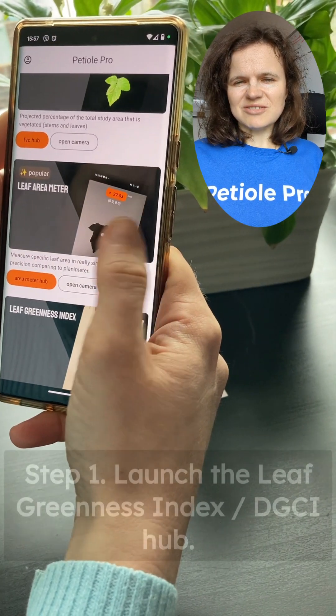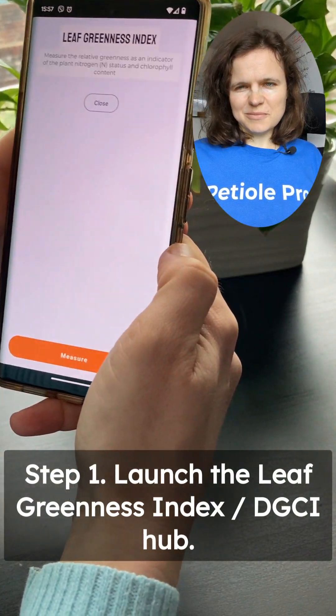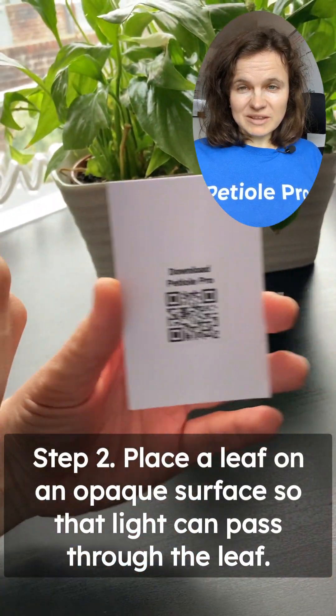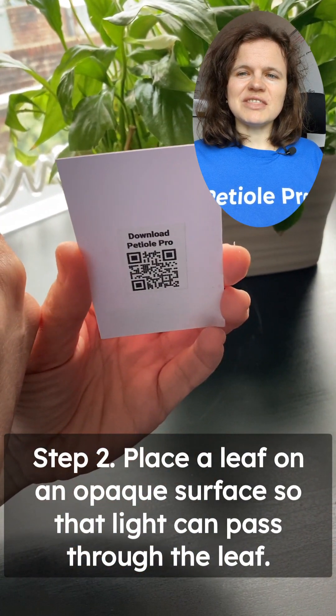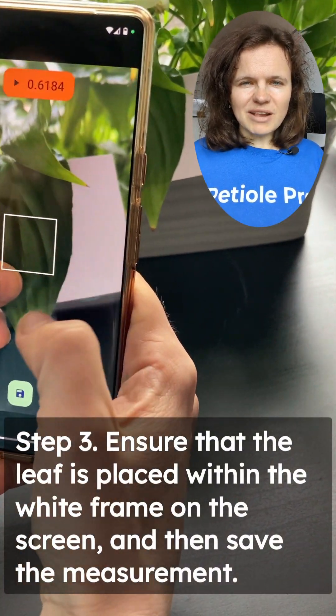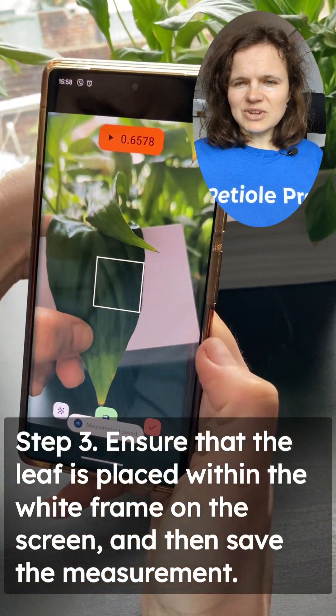Let's look at how it works in real leaves. Launch the leaf greenness index function on the PTO PRO. Place the real leaf on a piece of cardboard — white cardboard or other surface — ensuring the white frame on the screen fully covers the leaf. Take multiple measurements of the same leaf to get a more accurate reading.